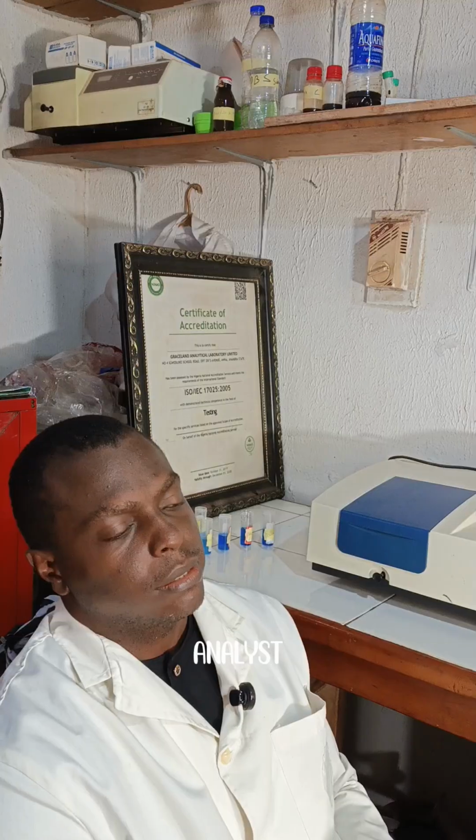My name is Dr. Onyebuchi Joseph Wandiogbu, and today we will discuss UV visible spectrophotometer: principle, operation and application. If you are a student, a lab analyst, a researcher, it will be good that you lend me your ears and watch this video to the end.